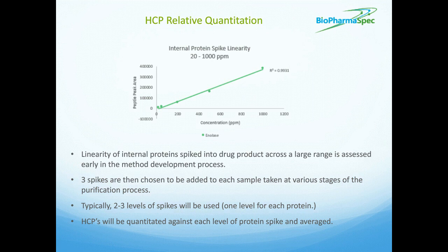We use the high 3 method of quantitation at this stage in the workflow. The high-3 method uses the average integrated signal intensity of the top 3 most intense peptides. And this signal is generally proportional to the absolute amount of protein in the sample.